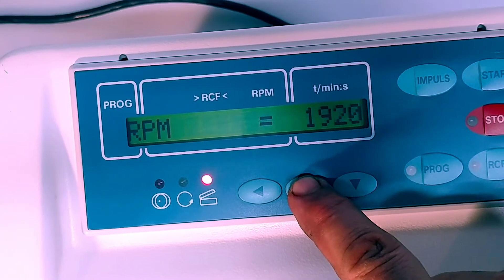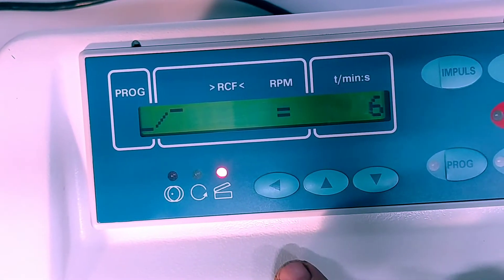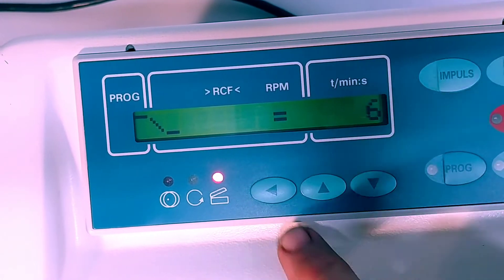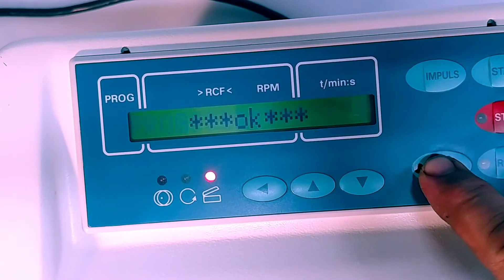And we'll set the speed up to 2,000 rpm. The speed for the current rotor can go up to 5,000 rpm. We'll set the acceleration at seven, set the deceleration at seven, and we'll engage that as program one.